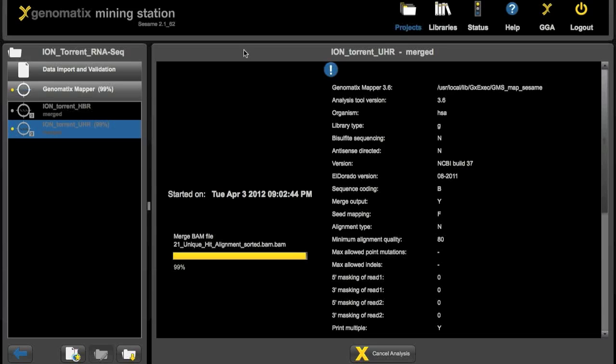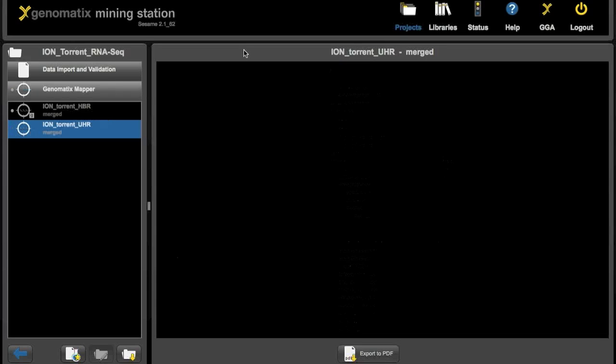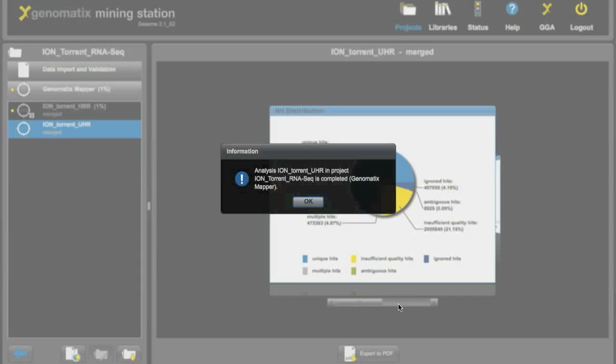As you can see above the progress bar there are always short messages informing you at what stage the analysis currently is. And as soon as everything is done you will get a screen with some key statistics. Here comes a little window showing us that the analysis is finished.